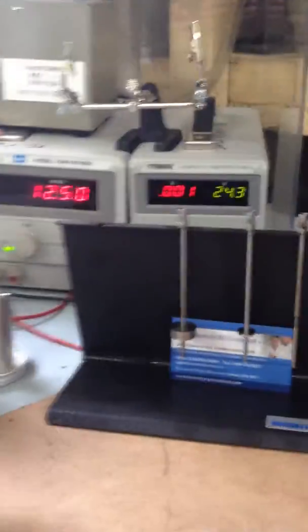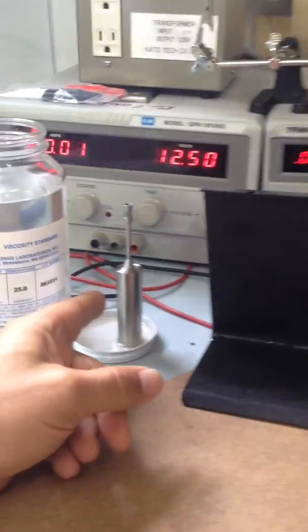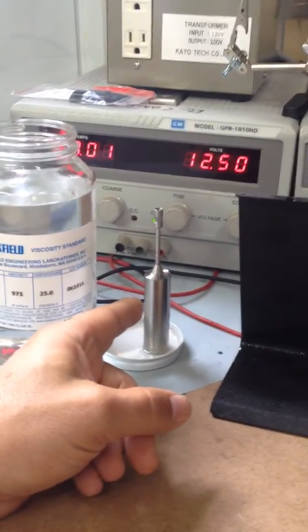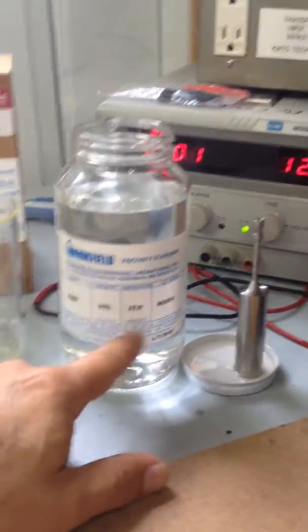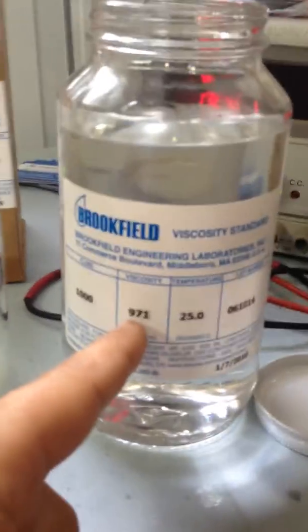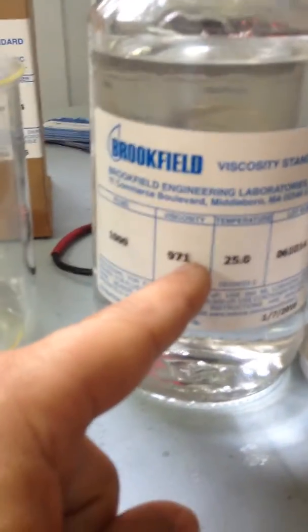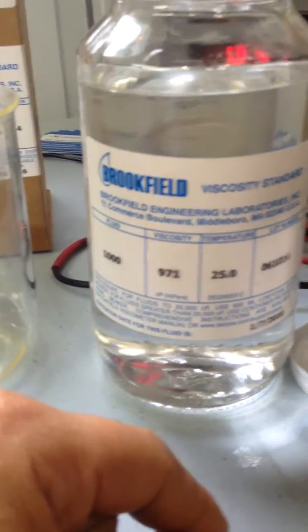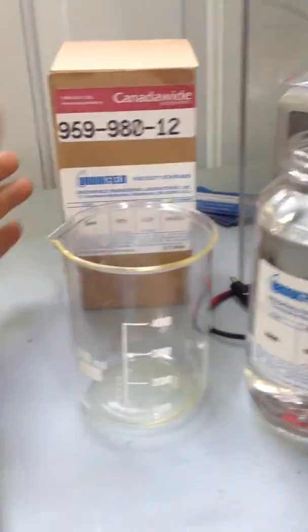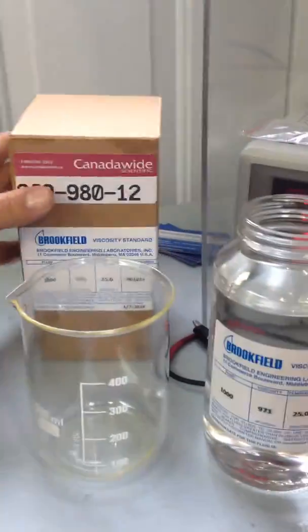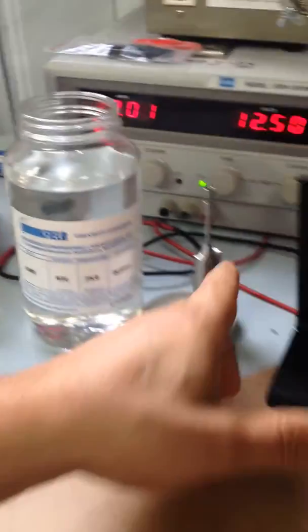In this case there's different spindles that can go. The setup that we have chosen for you is pedal number one. We're going to be using this one with a viscosity standard at 971, which is the centipoise.